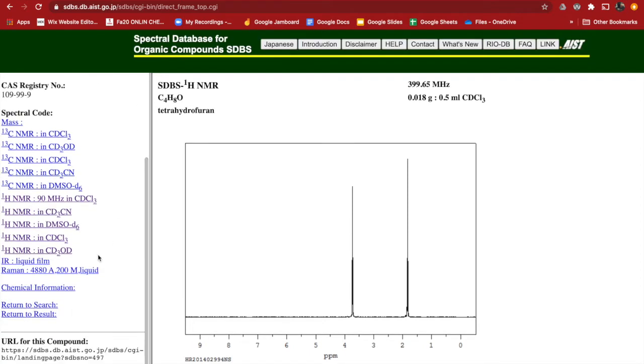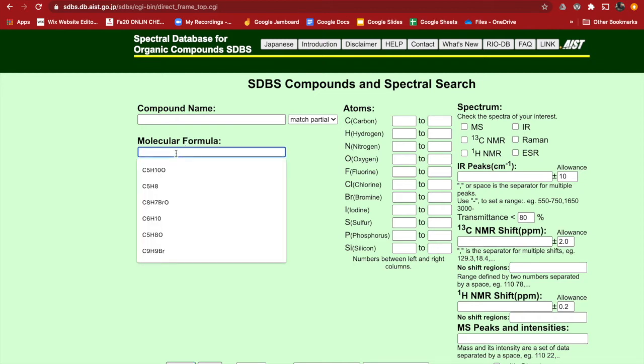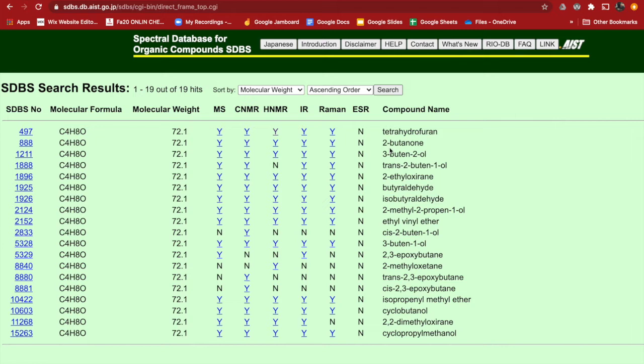So that was the first one I just clicked on, right? Return to results. Return to search. I forget which one I want to do. Oh, I didn't want that one back. I did it again. So I did C4H8O, I think is what I did, right? Surprised I remembered it. All right, if I actually click the one that already came up, nothing happens. Sometimes I sit here and wait. Why isn't anything happening? You could click manually search, but if you just hit enter at this point, now it'll go. All right, we already looked at tetrahydrofuran. Let's look at 2-butanone. We'll go to the proton NMR.